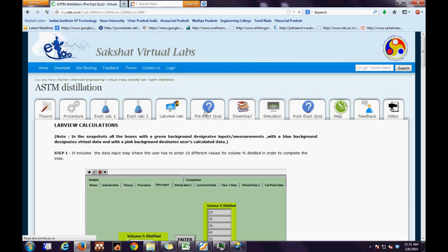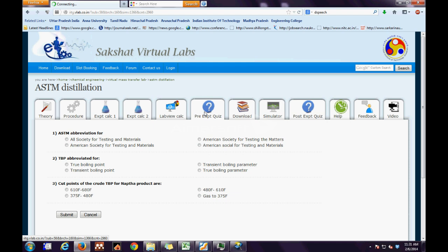The next step is the pre-experimental quiz tab. Here the user has a few questions related to the experiment. All the user has to do is select the right choice and submit. As he presses submit, the software itself will let him know whether his answer was correct or not.